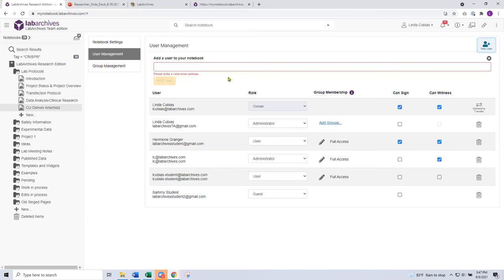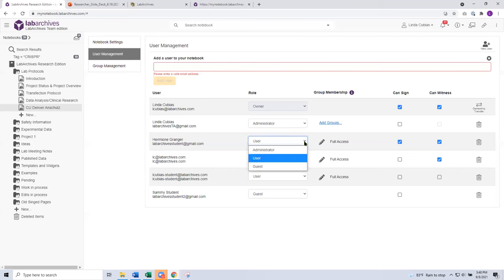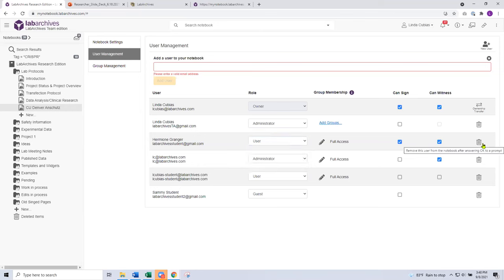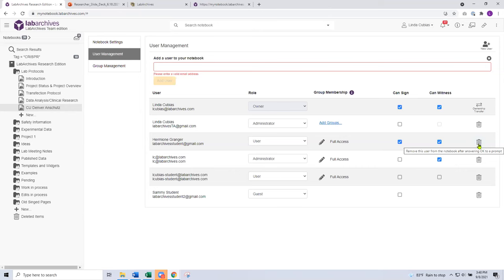Continuing on with user access — after inviting somebody to the notebook, they've accepted the invitation. When you first invite someone, they're given the user role. But as soon as you invite them, you can change their role — upgrade them to an administrator, downgrade them to a guest, or remove their access. This is especially important because as an owner or administrator, you control who has access. Let's use Hermione as an example — a grad student who's graduating and leaving the university. You can remove her access, but when you remove her access it does not take away her contributions. Any data she's added remains, she's still part of the revision history and the audit trail — she simply loses access.